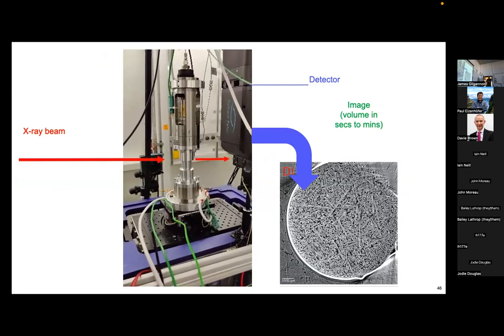Right near this is a bigger experiment. Essentially the X-ray passes through the sample, through the thinnest part of the sample that's X-ray transparent. There's a camera, and those projections are processed such that we can reconstruct slices through the image. But now we have volumes. That's the really important thing. We now have a complete digital record of everything that's happening. The problem to be aware of, which I'll go through, is that we have very large data sets. And this is a whole challenge in itself.